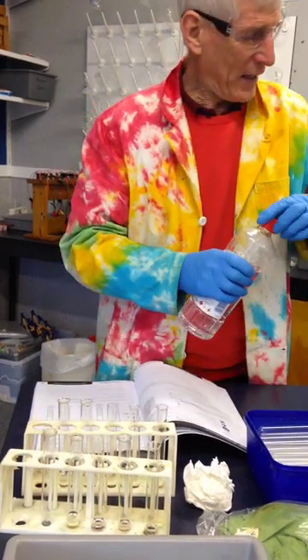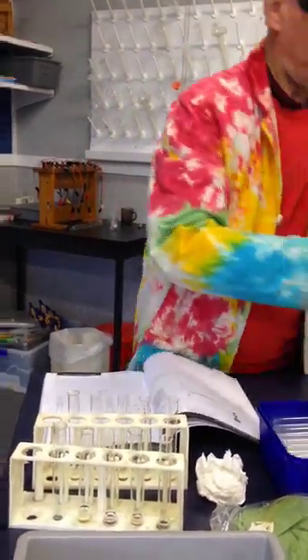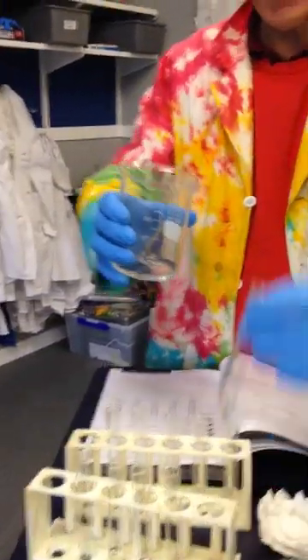I'm going to add hexane to each one, just a little bit to each one. So I'll use this hexane here.